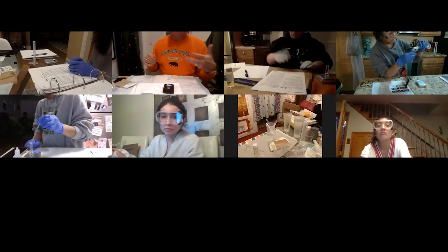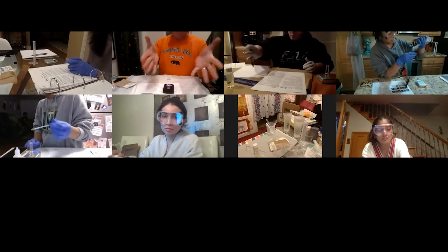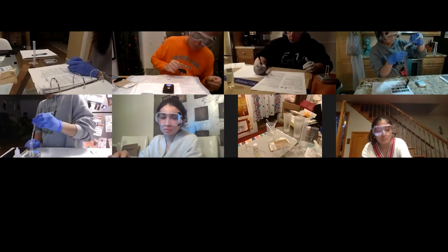So for the second part, I'm going to do the experiment as well, and I'll be sending out updates of what mine looks like so you can compare them to yours. So 2 grams appears to be about that much.